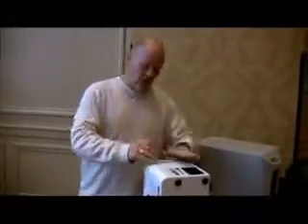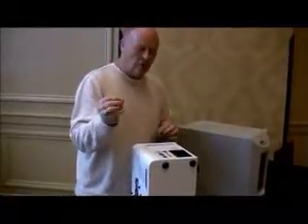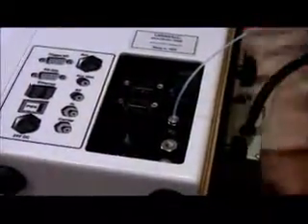Okay, so the handy thing about CALIDUS is it actually has a handle, and you can move it around a little bit, make it a little bit more convenient. Remember, we hooked up a little Y or T of the air lines, and it's pretty hard to get them confused because we use a typical fitting for chromatography. I guess this would be called a female fitting, and it goes on to the male fitting that's labeled air right on the top or the side of the GC. And again, we don't need to go crazy with tightening. Over tightening is as bad as under tightening. Just snug it up and bring it home just a little bit. We're going to leak check as well. Don't ever forget we have to leak check. So now the air line is hooked up.